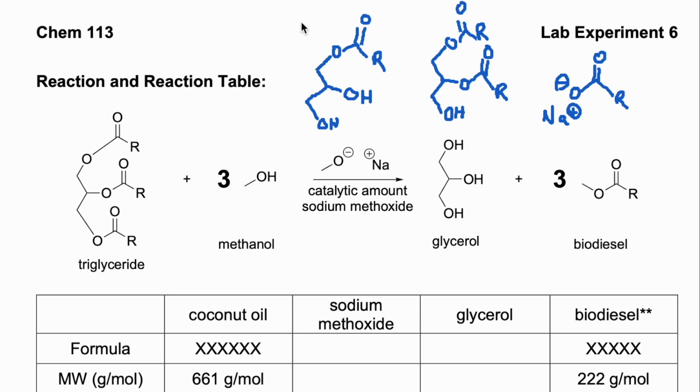So this was our Lab6 experiment reaction, and I just wanted to go over how to look at the different analyses that we did and try to figure out whether the reaction went the way we wanted it to or not. We did an IR, we did a GC, we did NMR, so we have some data about the reaction. Let's see if we can figure out what to look for on these spectra.